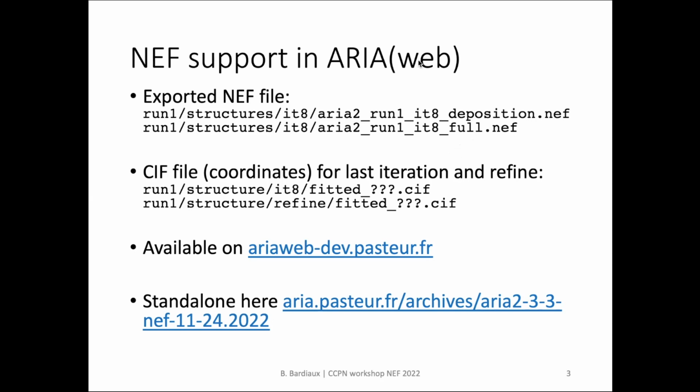And so basically the support of NEF is close to being finished, but it's still in development. I have to thank Vicky, Eliza, and all the NEF working group that gave us a lot of feedback and helped to have this included in Aria. It's available on our development server, this Aria Web Dev. And if someone is interested, we also have a standalone version that has to be installed on your computer and that you can use locally.